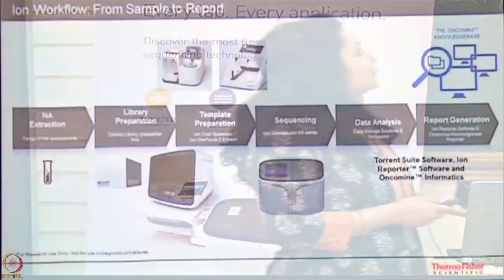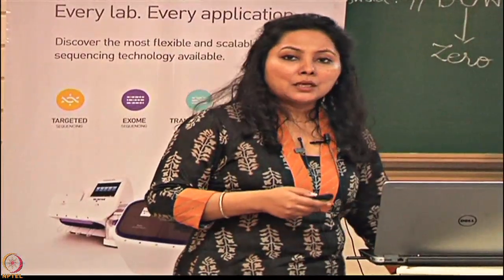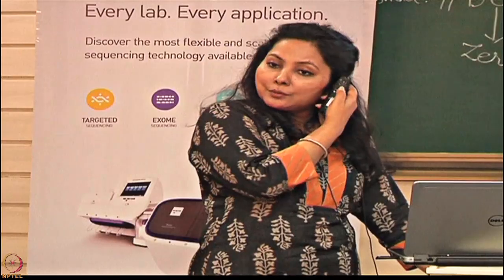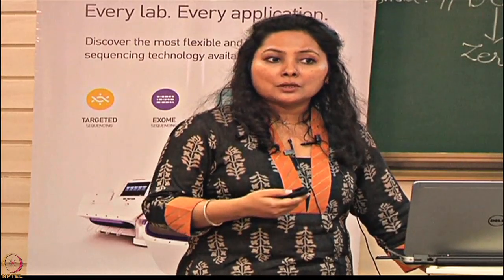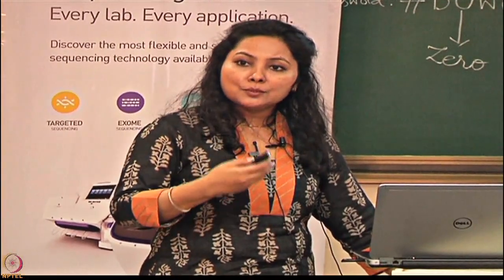Then comes template preparation. Now these are the things which are specific to a technology. In template preparation, you are taking these library molecules and amplifying them onto ion spheres. We are talking about Ion Torrent technology, so we are using ion spheres as the mode.